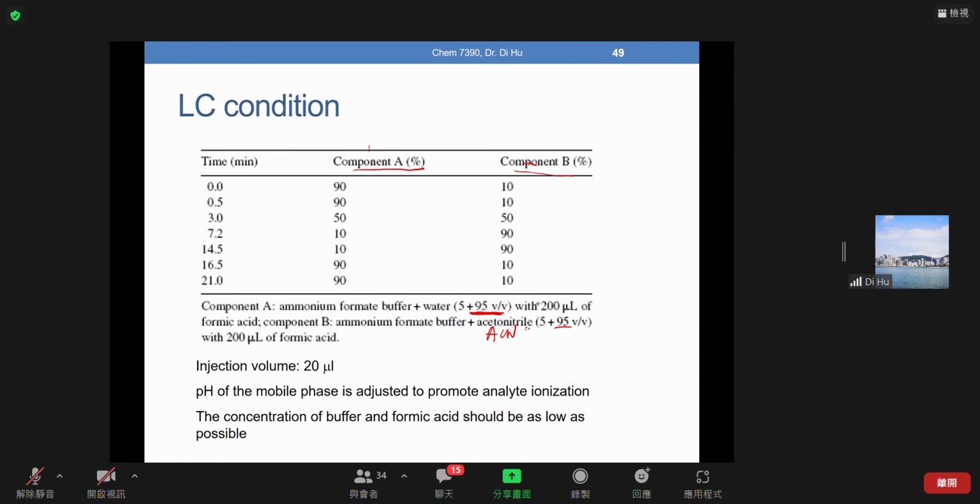In reverse phase chromatography, most of the time ACN or methanol are the two often used. Because when we think about the organic modifier, we think about properties such as miscibility with water, which should be good, and polarity, and even if you're using a UV-visible detector, you have to think about the UV cutoff wavelength, and also viscosity and so on.